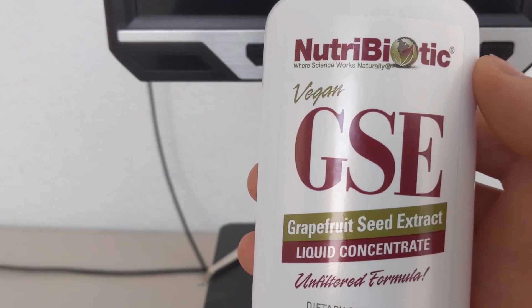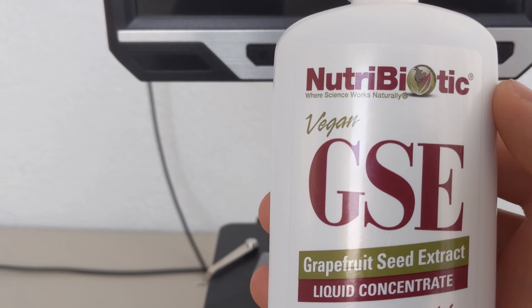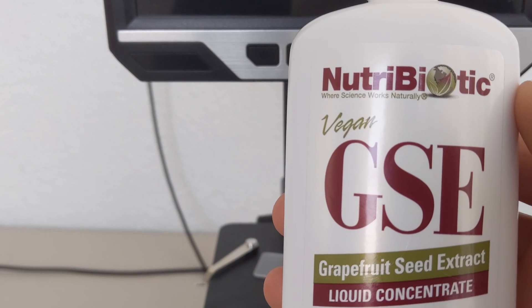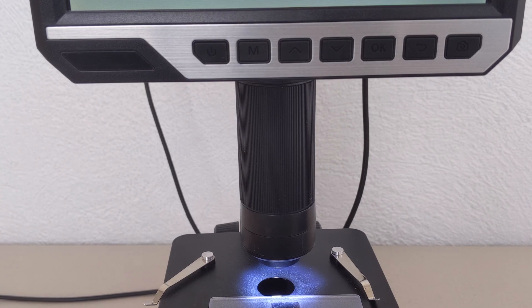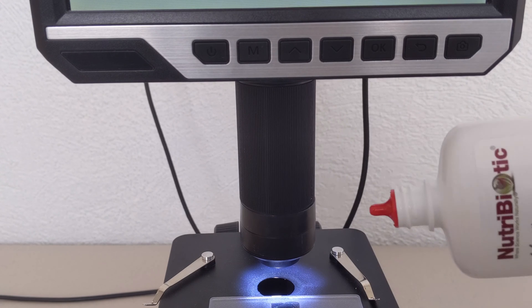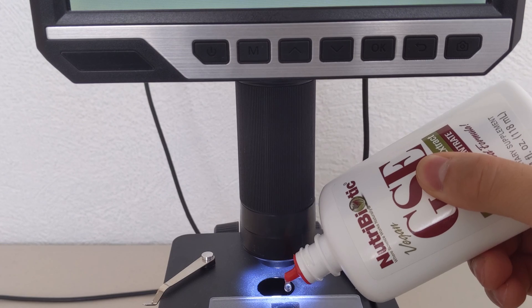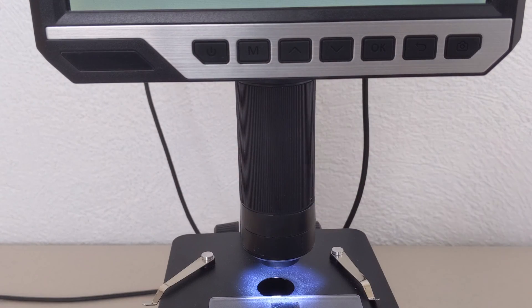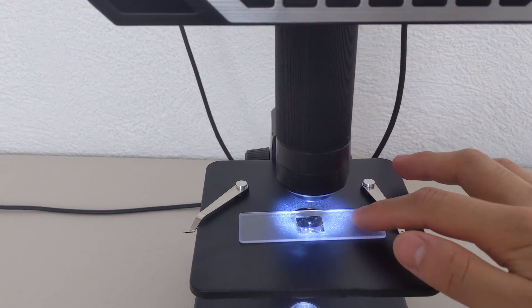GSE is primarily promoted to treat or prevent infection. It is believed to be simultaneously antibacterial, anti-viral, and anti-fungal. Now I'm going to add one drop of this product to the water sample. Yes, so now we can see how it works.